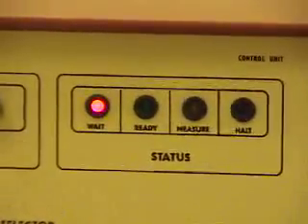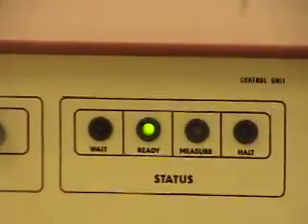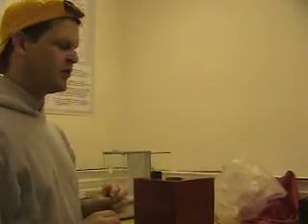Okay, so it should be almost done. And the important rule when working with this on low settings is not to have a belt or a wallet or a cell phone on. I'm wearing my wedding ring on my right hand so that it doesn't get in the way of the machine. Even pennies waved around can disrupt the readings.